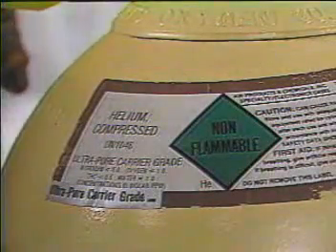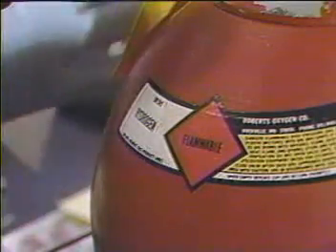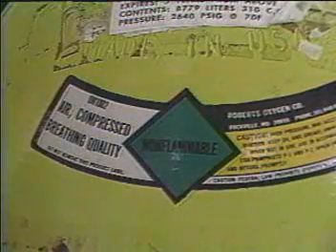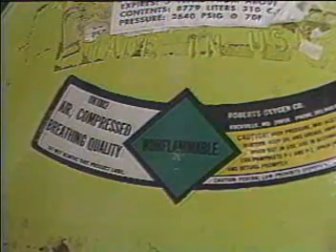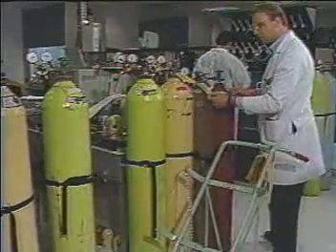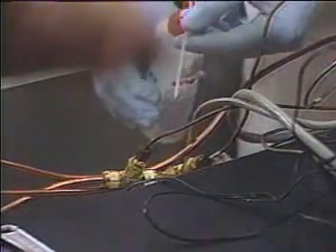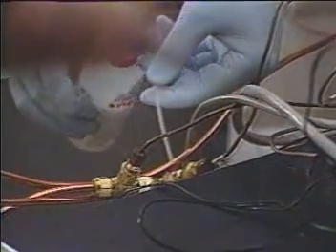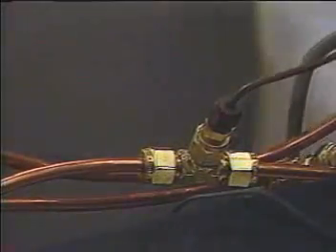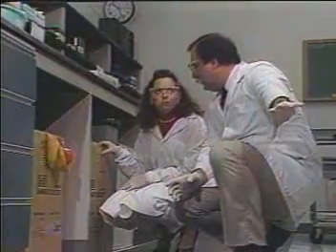Labeling is again important. Relying on the paint color of a cylinder is not enough. Many suppliers do not adhere to a strict color code. Do not mix flammable gases which may react with one another. Check all connections for leaks before using a cylinder. Use a diluted soap solution at fittings and valves. Check for bubbles.